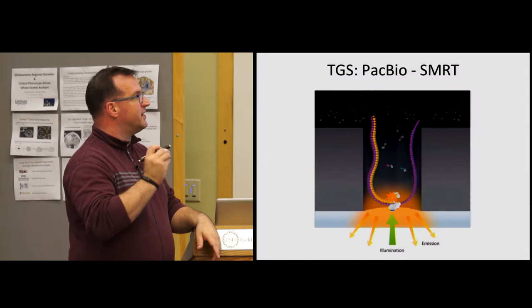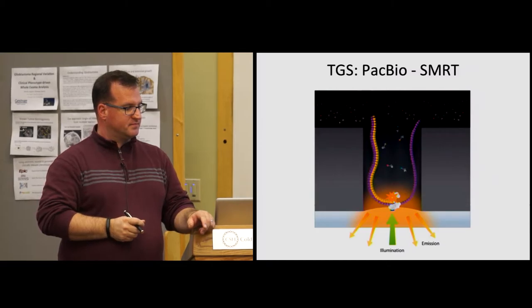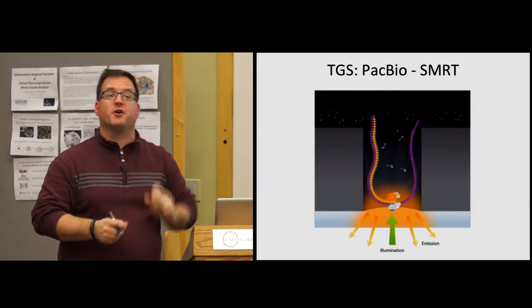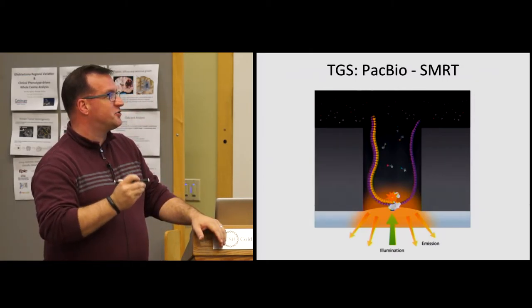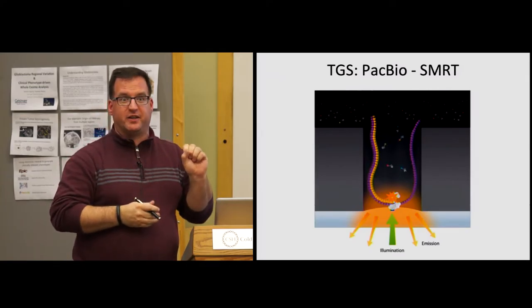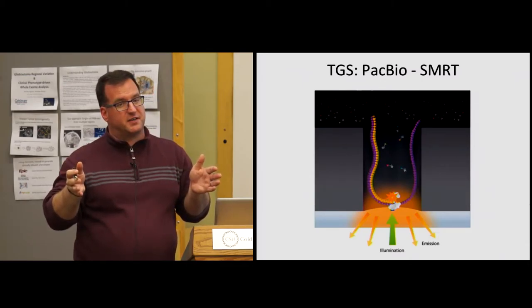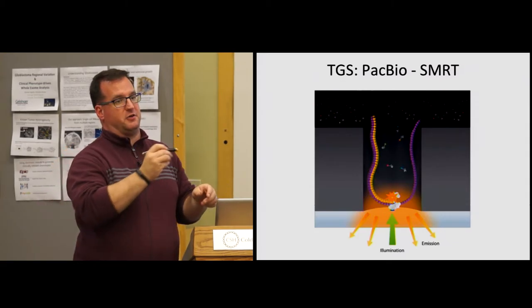So one of the aspects of PacBio sequencing is this kind of probing, I'm sorry, I'm blanking on the word. Somebody help me. When the lights go on and off, it's a strobe. Strobe, thank you. Not probe, strobe. The idea of strobe sequencing is that they turn the light on, you get to watch the video and see what nucleotides, and then you turn the light off. And while the light's off, more nucleotides go by. You don't get to see those, but you know for how long you kept the light off, and you know the average processing rate, so you can make some ideas about how long that particular gap might have been. Then you turn the light back on, and then you get some more reads.